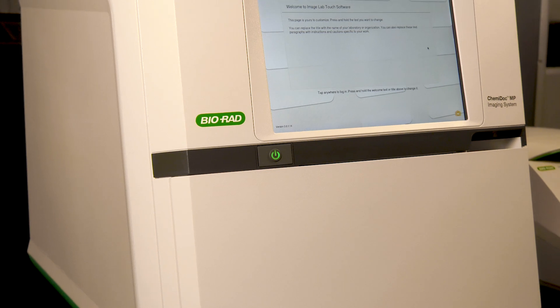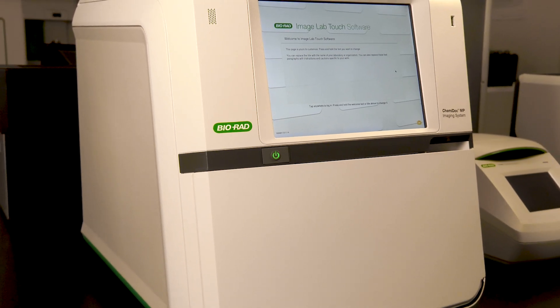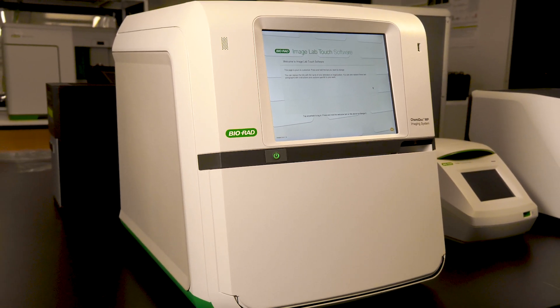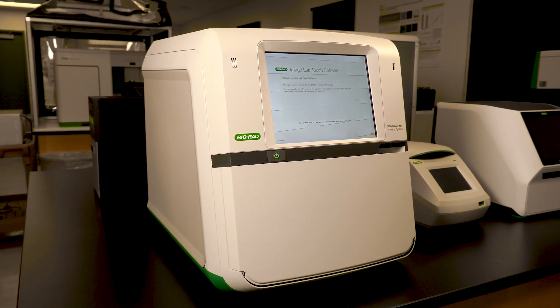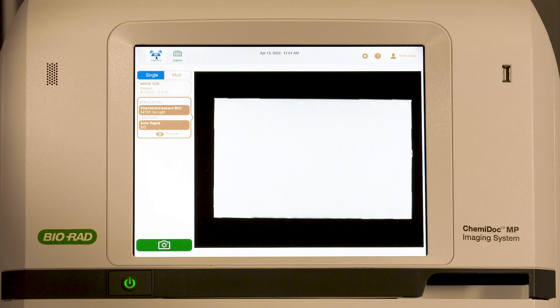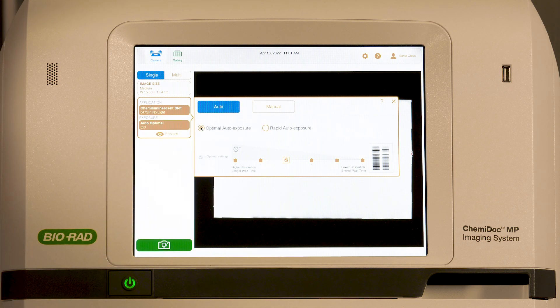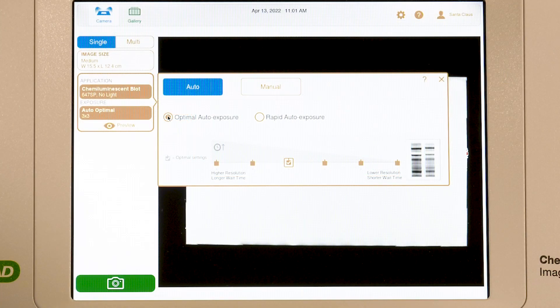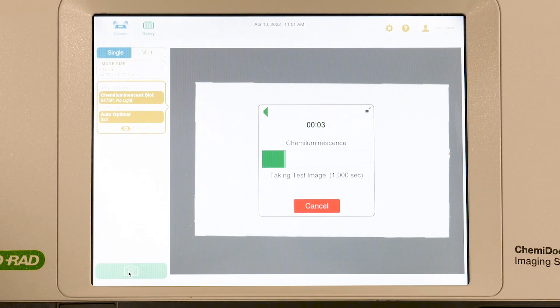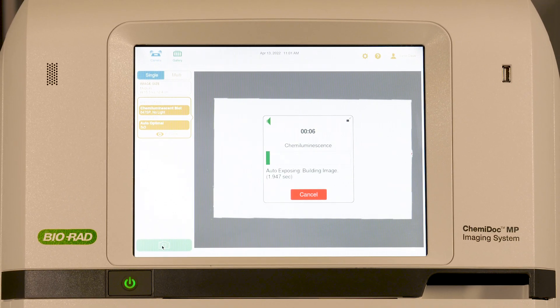In this video, we review the differences between the optimal and rapid automatic exposure settings on Bio-Rad imaging systems running ImageLab Touch software. You may have noticed that there are two auto exposure options in the ImageLab Touch interface. These options provide flexibility in image capture. For most blots, we recommend using the optimal auto exposure setting, which uses longer exposure times to increase sensitivity and maximize dynamic range without saturated pixels.